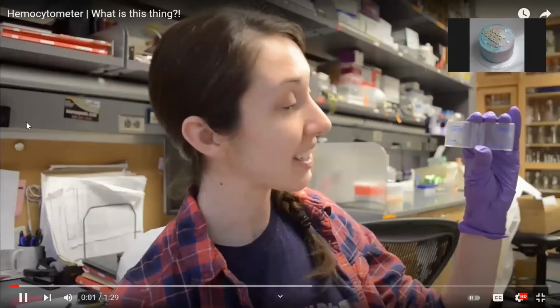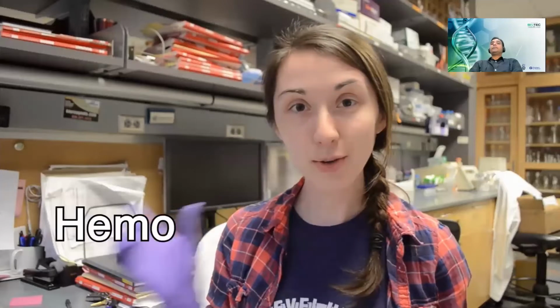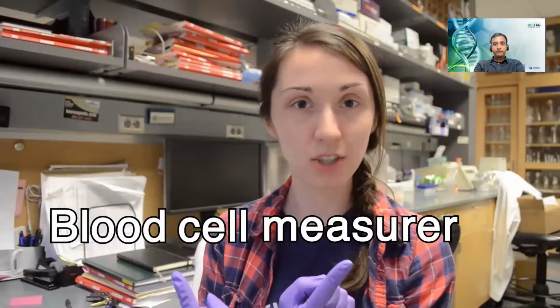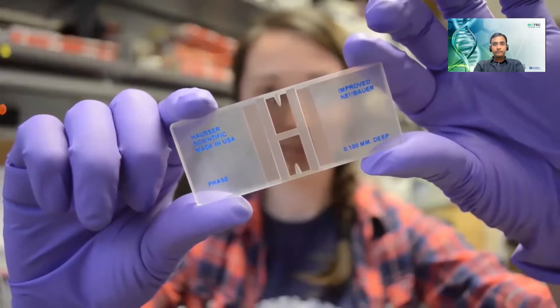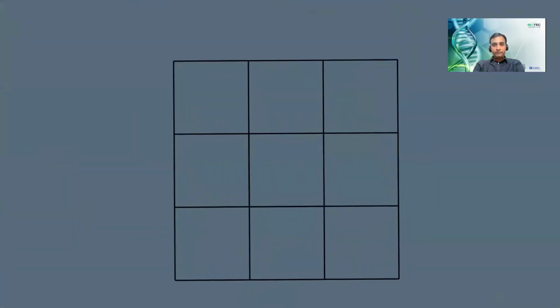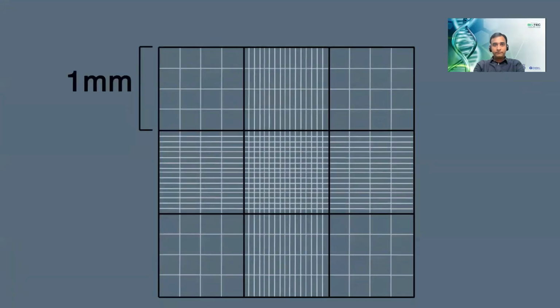Yes. The hemocytometer. It's used for counting cells and was originally used for counting blood cells. Hemocytometer: blood cell measurer, counter. The hemocytometer is a thick microscope slide with 2 counting chambers on reflective sections. Each chamber is divided into 9 main squares with a series of etched lines. These squares are 1 millimeter by 1 millimeter, or 1 millimeter squared.